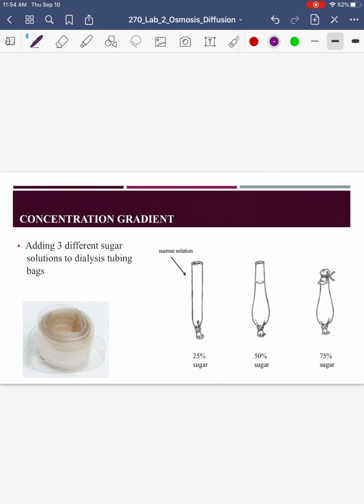Let's first start with concentration gradient. Now, if we were in the lab, we would be doing this. I'm just going to walk you through it.